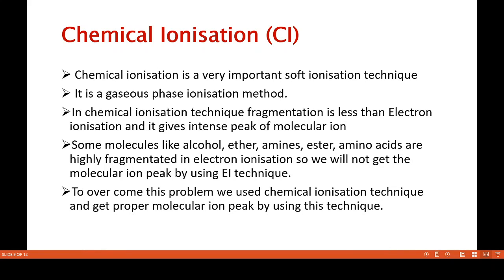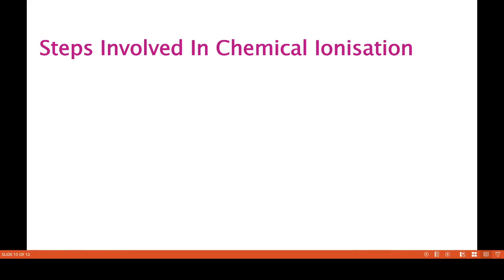To overcome this problem, we use the chemical ionization technique and get a proper molecular ion peak. This is about chemical ionization.